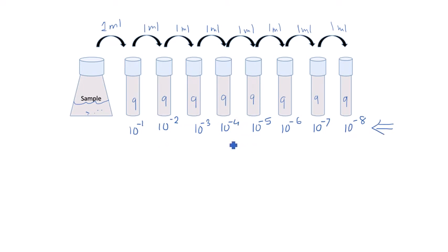Say you selected tube number 4, and we always take 0.1 ml from the dilution tube onto the plate to spread the culture. And after spreading the culture, say you had 120 colonies. So you're taking it from tube number 4, where the dilution factor is 10 to the power minus 4, and you're taking 0.1 ml and you're spreading it.